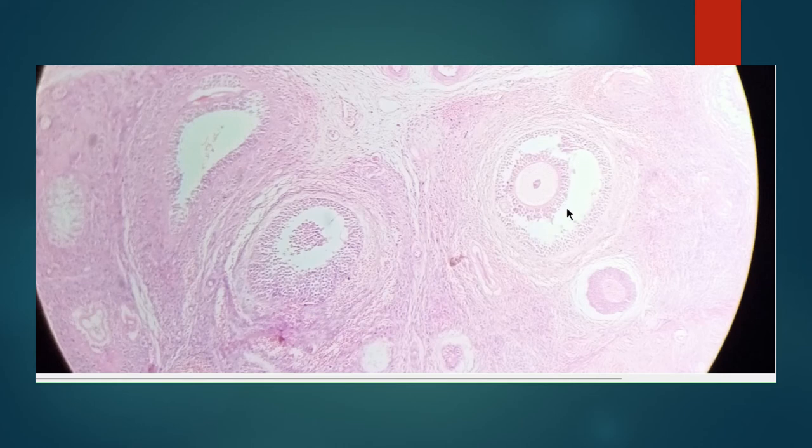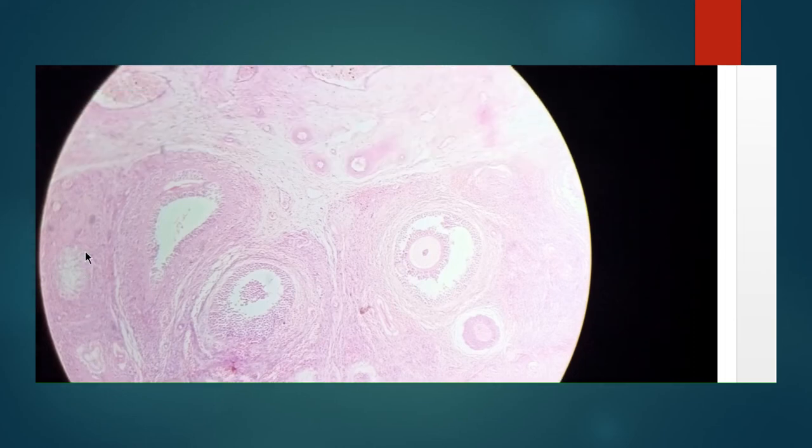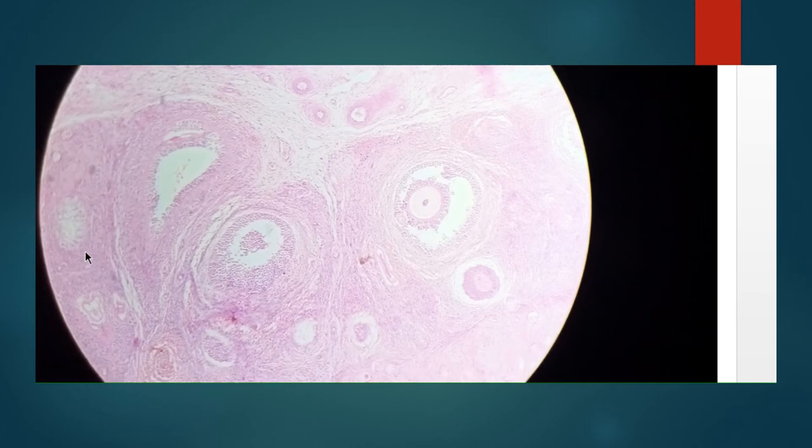So, the presence of the primary follicles and mature follicles, the zona pellucida, and follicular cells. These are all the follicular cells, these are the corona radiata cells, and these are cumulus oophorus cells. The presence of these things means it is an ovary. Right here, you can see the corpus albicans. The shrunken part is called the corpus albicans. These are all the identification points of the ovary.